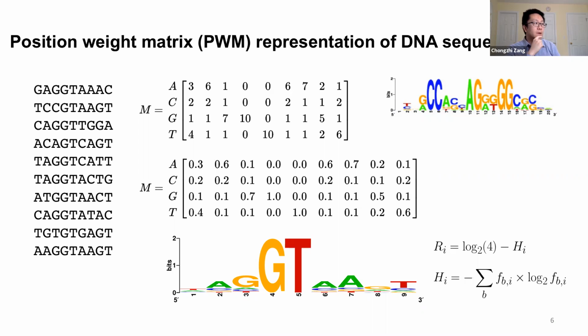Of course, for a ChIP-seq experiment, we already know what transcription factor we are targeting. For most transcription factors, we already know the information of their DNA binding domain and the specific DNA sequence motif that this transcription factor recognizes. But if we have ChIP-seq data, and especially once we identify the peaks, we will still do motif discovery. There are several reasons for that.